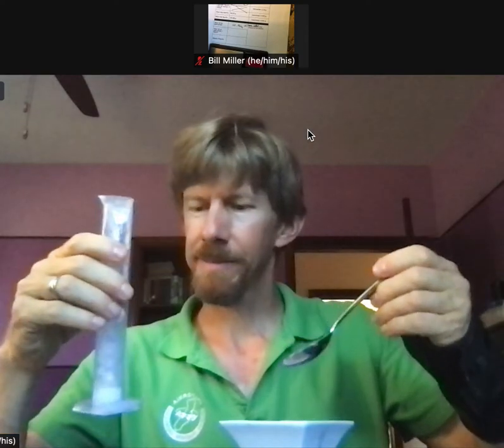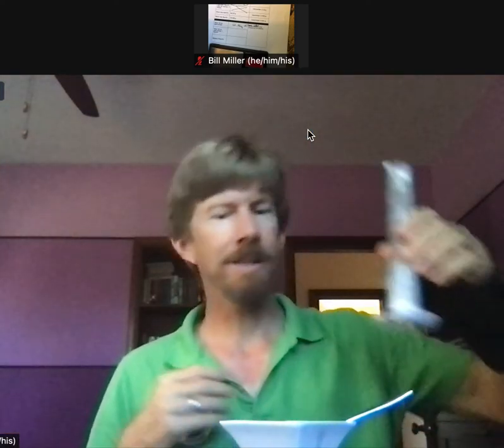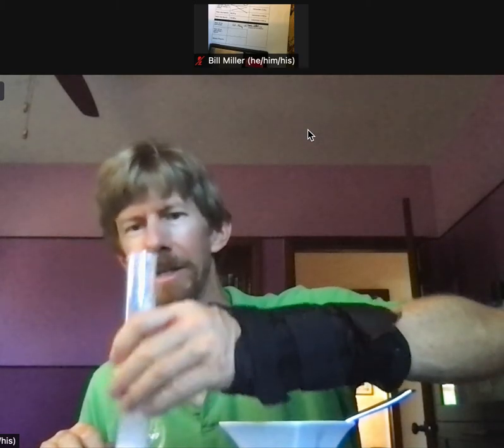What's happened is if you put the sodium carbonate in first and you hit it with the water, we tend to see little bricks of it, meaning it sort of solidified. It has a harder time dissolving, let's say that. So let's see how much we got in there so far. I know I got some on the side, but we'll get that down in a couple minutes. 47, so we're getting there.